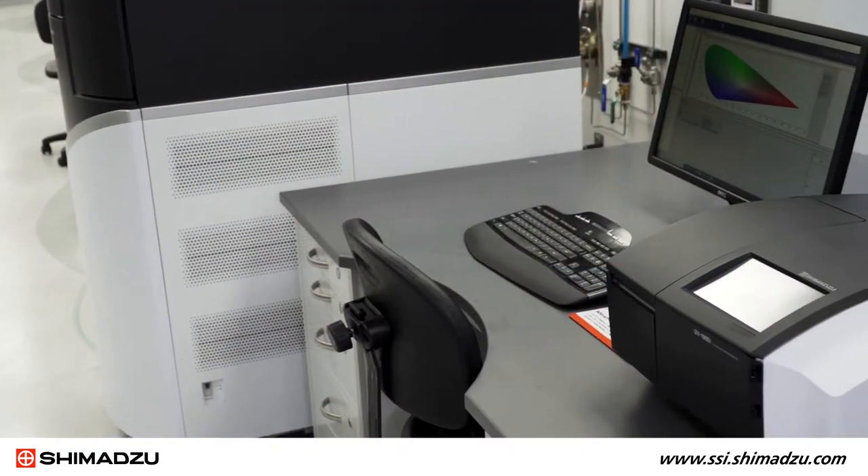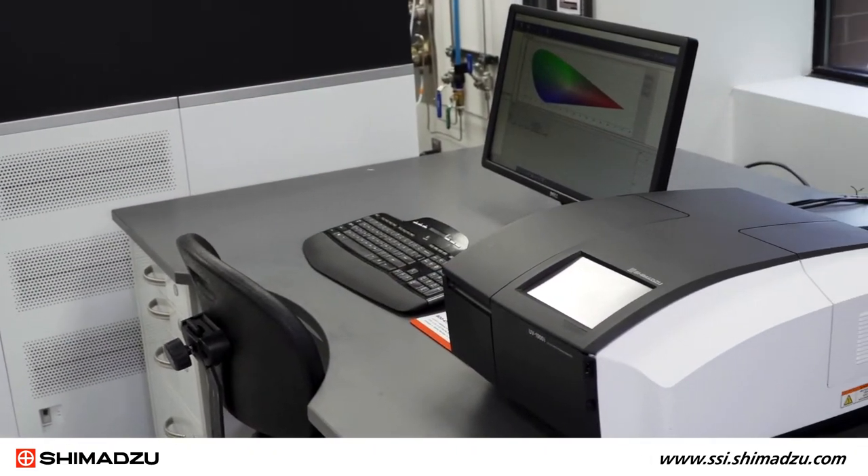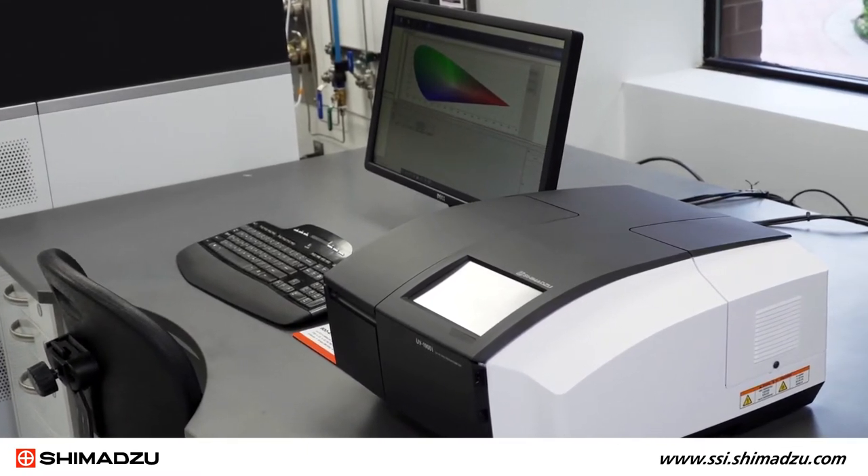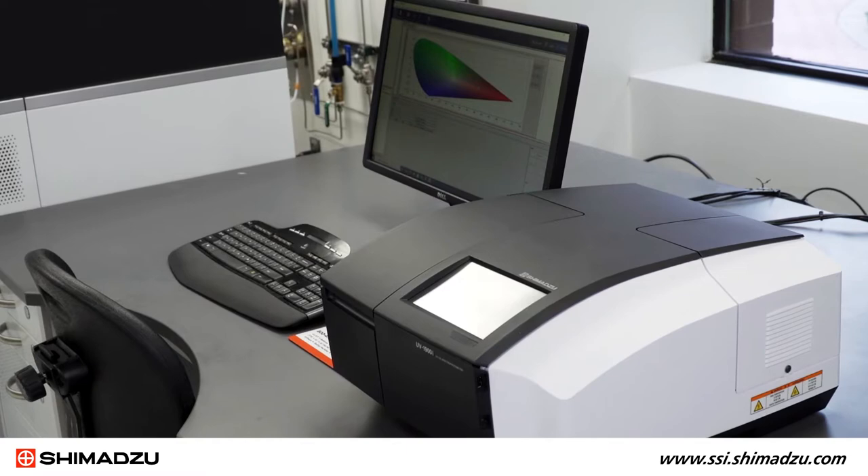Hello, my name is Gilbert Villal and I am the Product Manager for Molecular Spectroscopy at Shimadzu Scientific Instruments. In this video, I will demonstrate how to change the lamps in your UV-Vis spectrophotometer. This video will feature the most common model, the UV-1900i. However, this process can be used on most of Shimadzu's UV-Vis spectrophotometers.